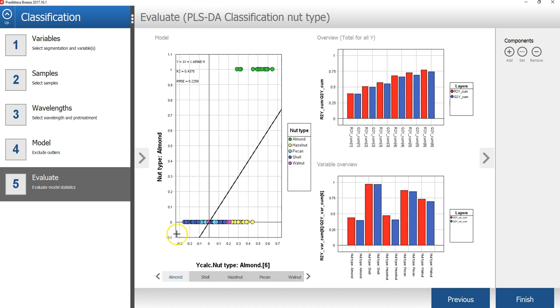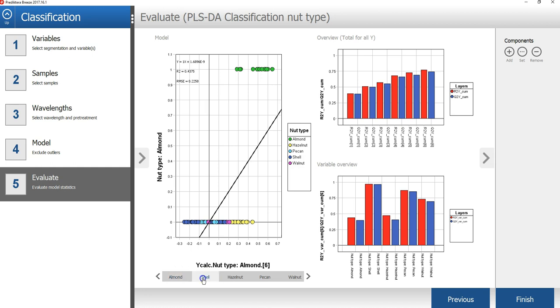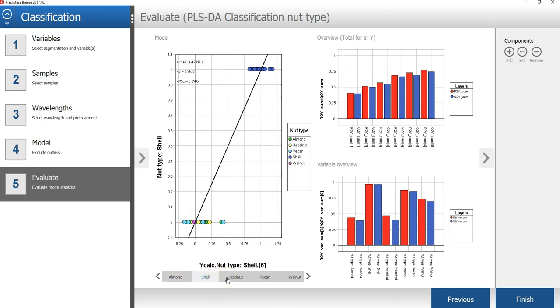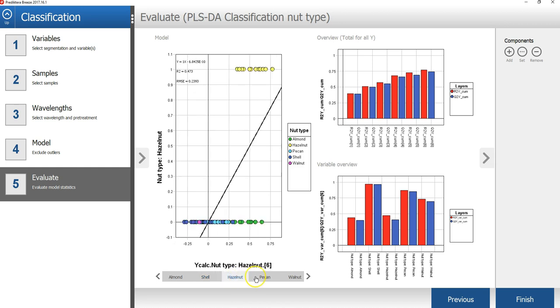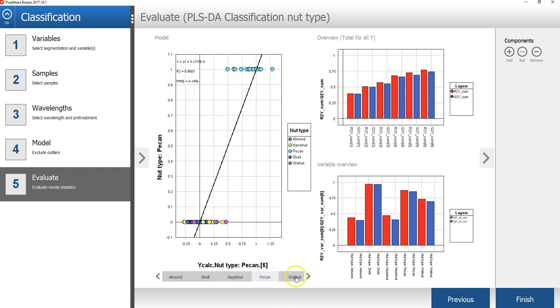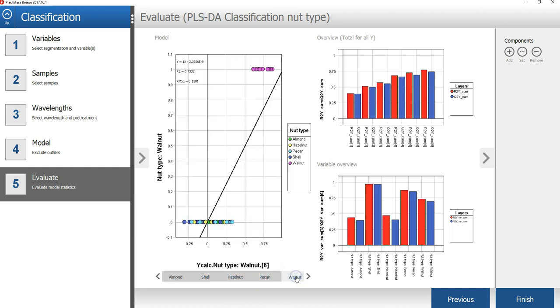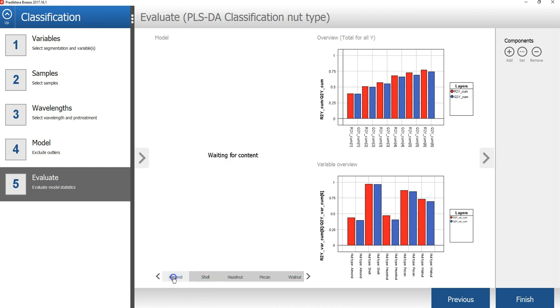The last step of the wizard, you can see the class separation by pressing the tab for the different classes under the nut type versus ycalc nut type plot. What you should try to look for is separation in the horizontal dimension. We can see we have an overlap between the almond samples and the hazelnut samples.